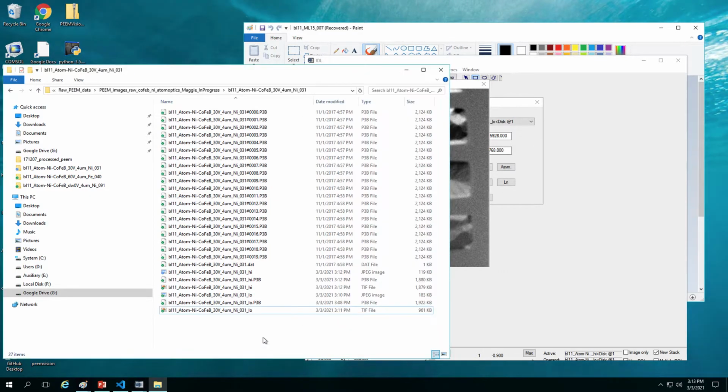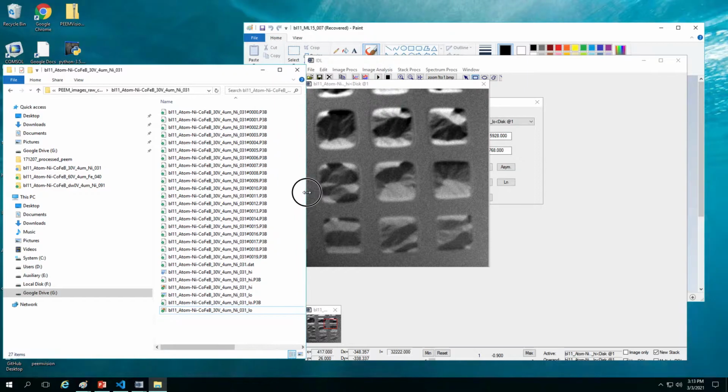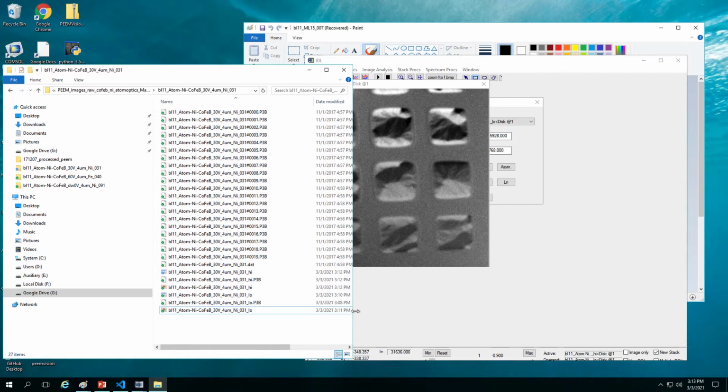All right. In the meantime, I would suggest you keep this folder open. If you have Google Drive for desktop, then it's better for you to see it in real time, how things are changing. So now you know, okay, I do have all the files here. And you will keep a note on the side of what folder this is, the folder name, and low, high, how many images you used. So for this, we used 4 images for low and 20 images for high.